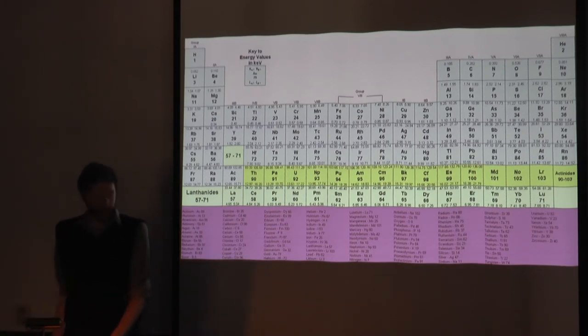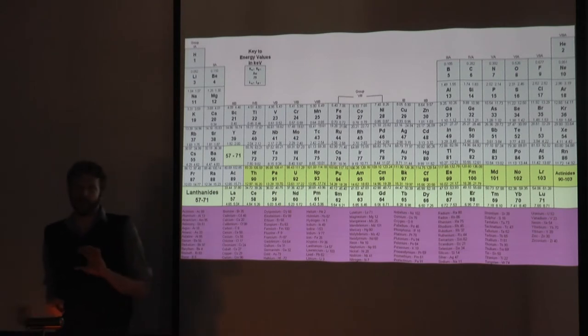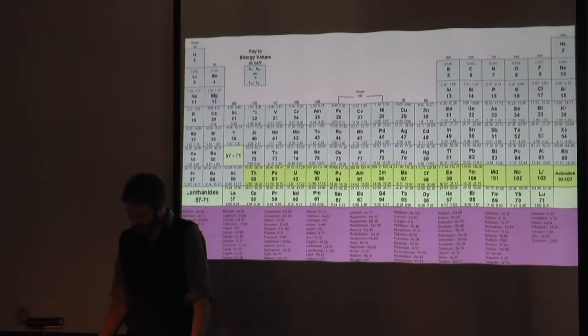Another way to think about this is that we could only read energies between 5 and 30. So if you can't really see it in the slide because it's a little fuzzy, but 5 energy for the K series is right there, and 30 is right there. So we can only read things in that range. Sorry, it looks better on my computer.